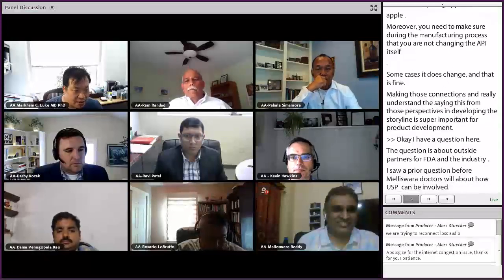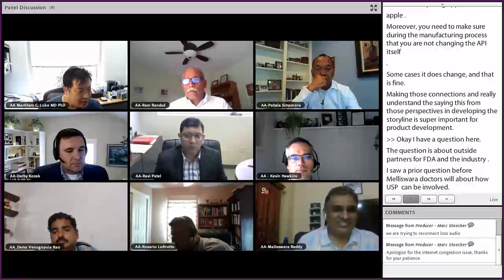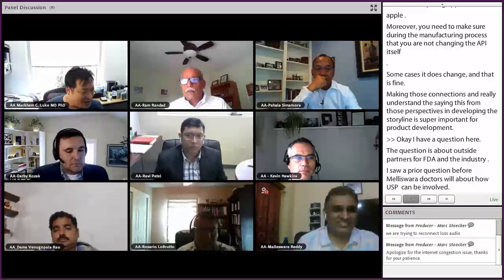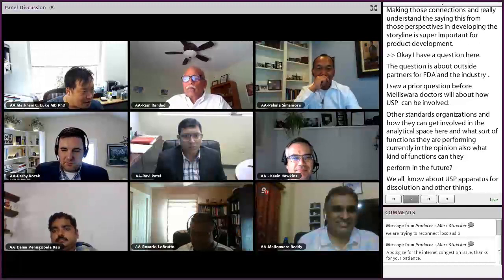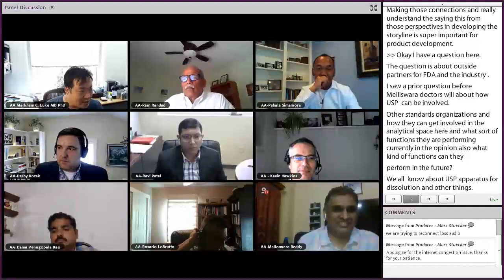And also, what kind of functions can they perform in the future? Or is there room to expand on those functions? We all know about USP apparatuses, right, for dissolution and other things. Maybe some of you might have some thoughts about that. If you have bad thoughts, hold those to yourselves, or you can couch them in a politically appropriate way here in the discussion. Please go ahead.